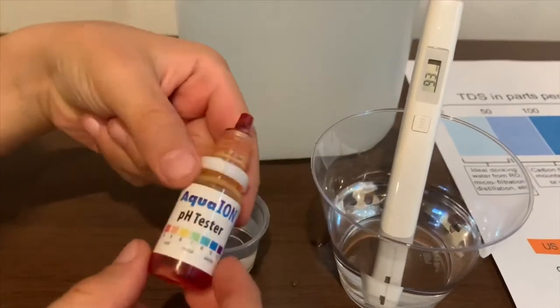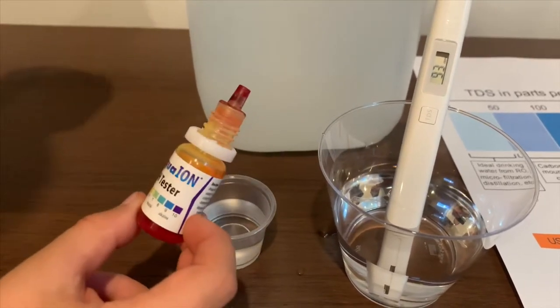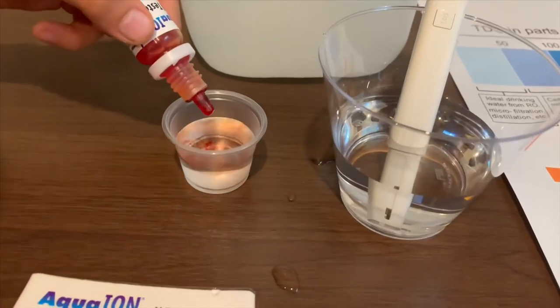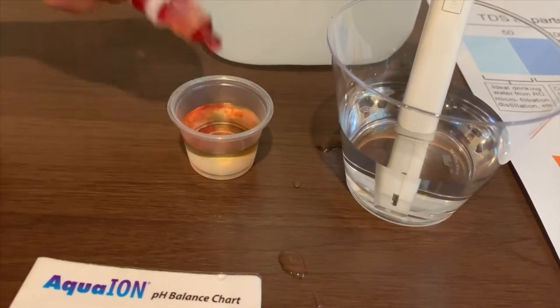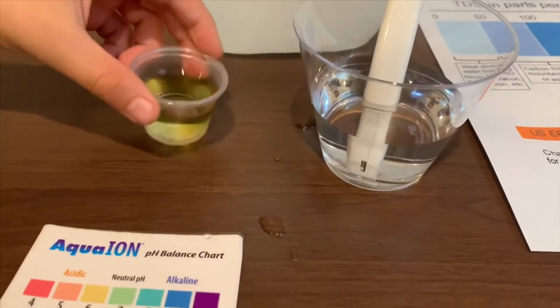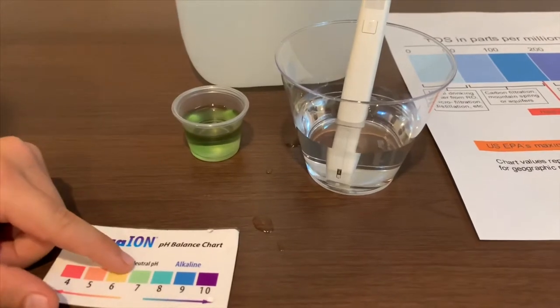Now, let's test the pH level. If you want to buy this pH tester, check the link down below. I'm going to do two drops. Let's stir it a little. This is seven — neutral pH.